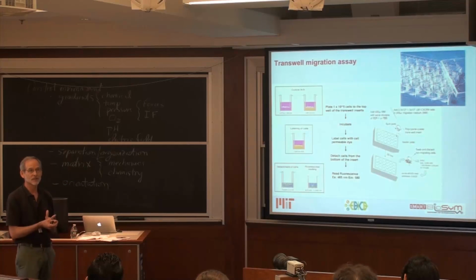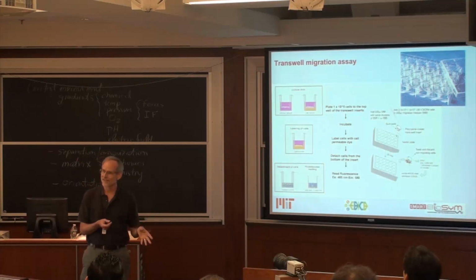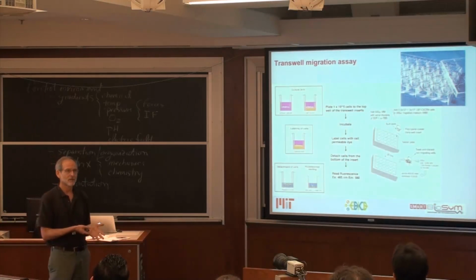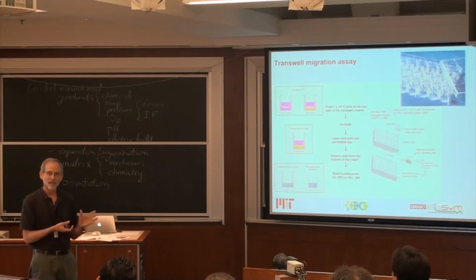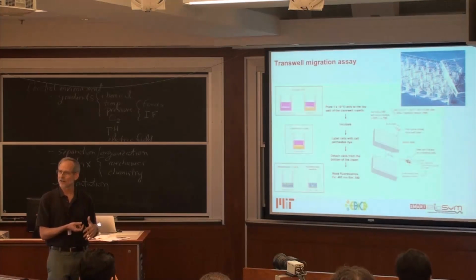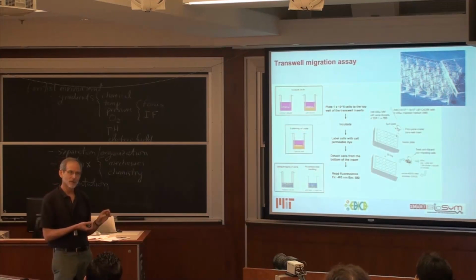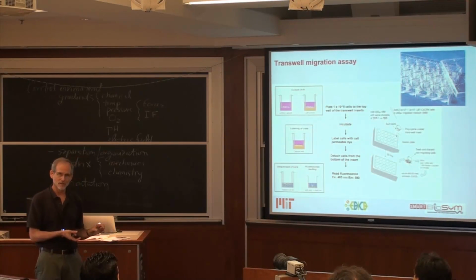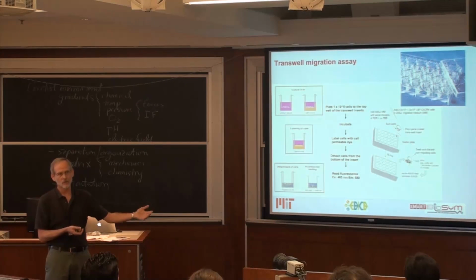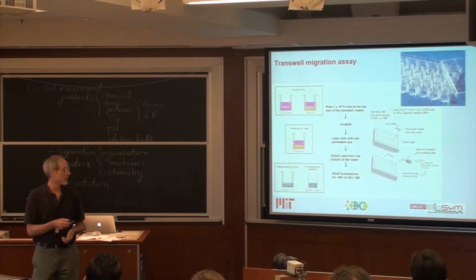There's a lot of interest in that, especially in the context of things like separating circulating tumor cells from the blood, these rare cells that just about any cancer patient has in their blood. There might be 100 of these in total in a milliliter of blood, so they're extremely rare. But if you can separate these out, you can imagine you can do all sorts of diagnostics on those cells and see what agents, what drugs you need to provide to the patient in order to prevent these cells from actually recolonizing and forming metastatic tumors. So a lot of that work is in microfluidics.